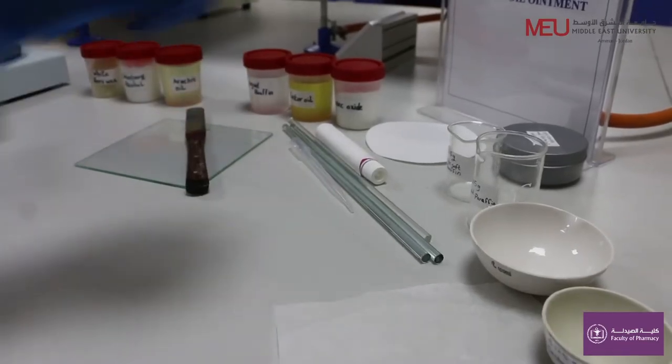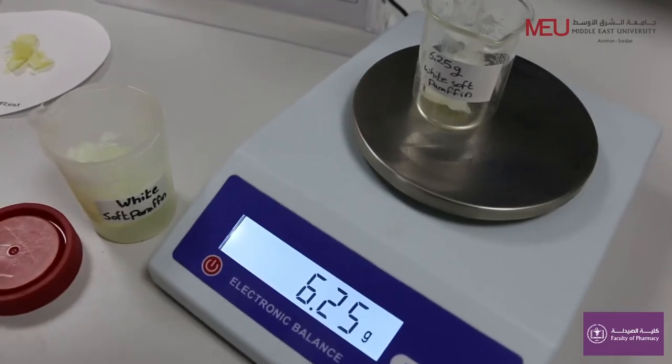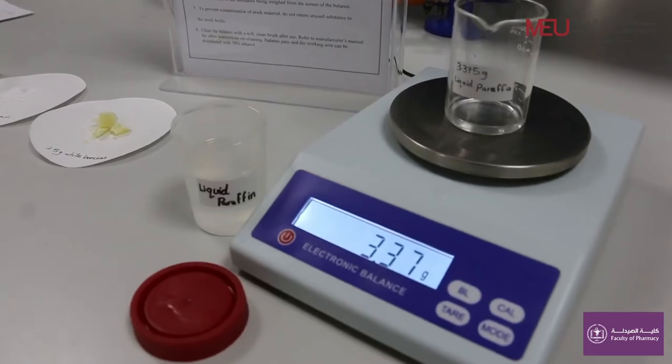Weigh 6.25 grams of white soft paraffin, which is used as an emollient. Weigh 3.37 grams of liquid paraffin, which is used as an ointment base.